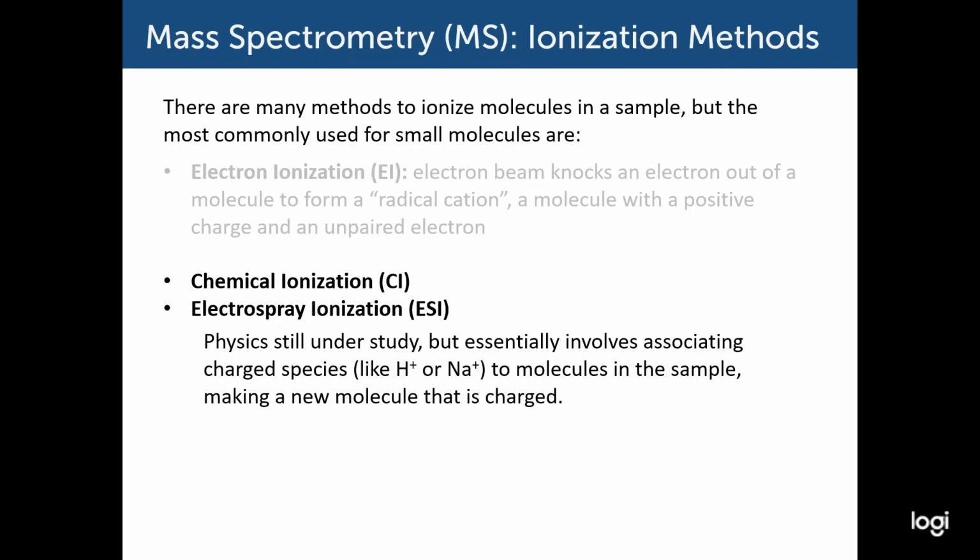All right, so we can also talk about different kinds of ionization methods briefly. Chemical ionization is kind of a boutique technique, so really what I want you to be aware of is that it exists. Electrospray ionization, or ESI, is quite common now. In fact, it's rapidly supplanting EI for the characterization of complex molecules like proteins, or even complex organic structures.